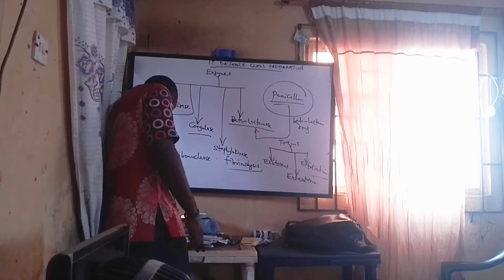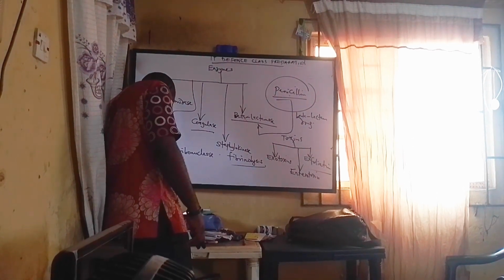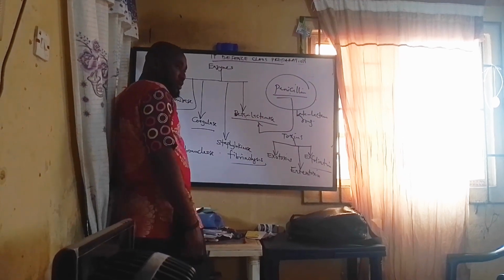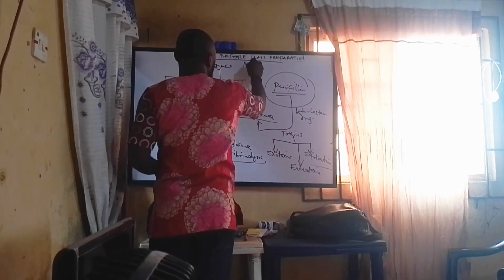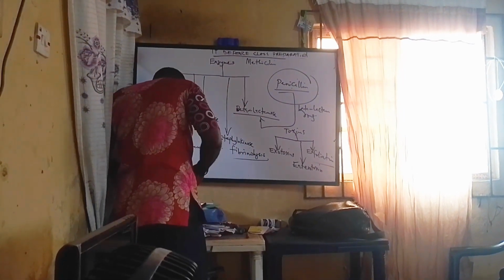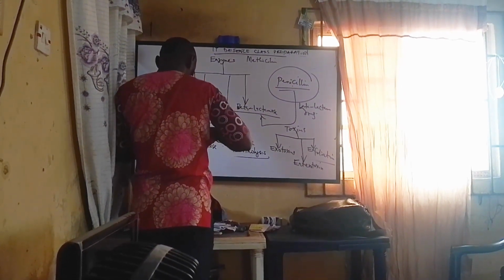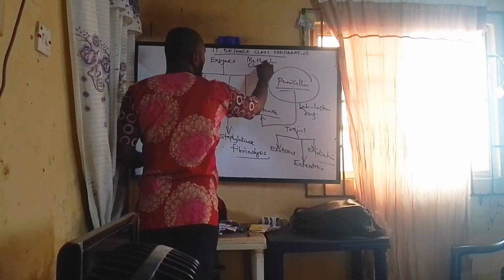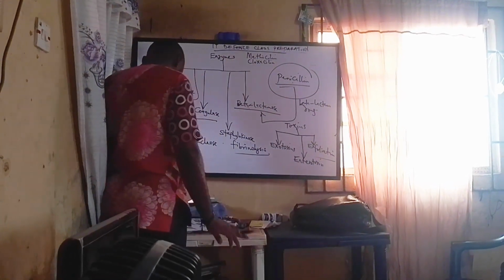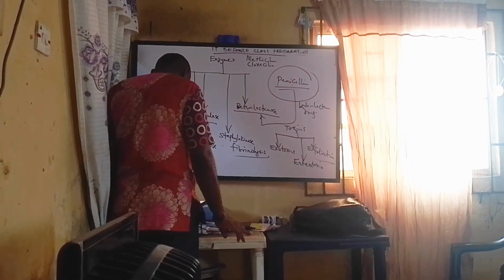We have methicillin, cloxacillin, flucloxacillin.